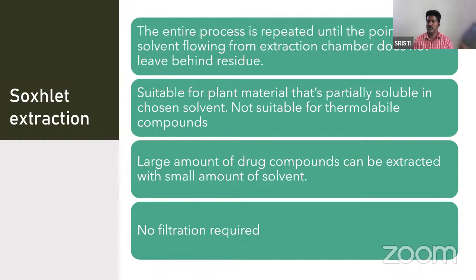Okay, this is suitable for materials that are partially soluble and thermostable. So if your compound is not stable to heat, you cannot follow this method, because we are continuously heating the solvent. Okay, so a large amount of drug compounds can be extracted with a small amount of solvent system, and no filtration is required, unlike the previous methods we saw.